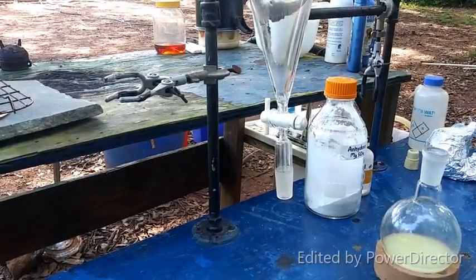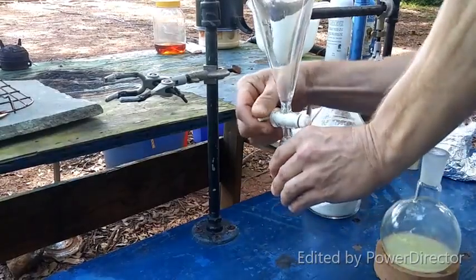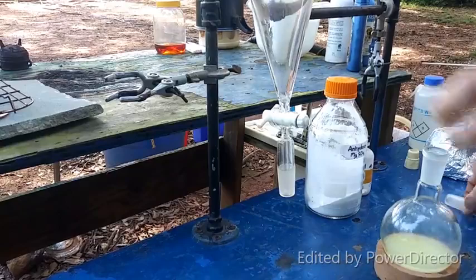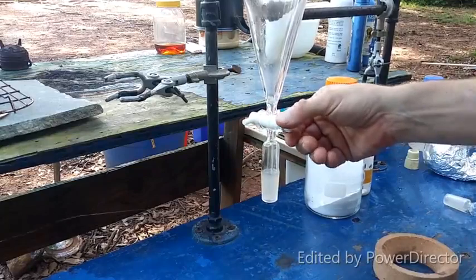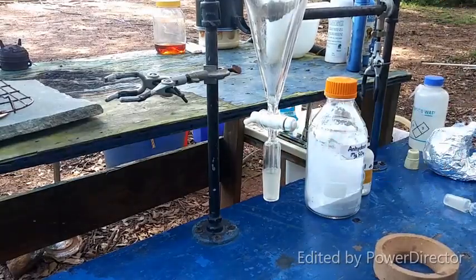Now we need to make sure that this is closed. Yep. Alright. And now I am going to transfer everything into the separatory funnel. Closed all the way. Okay, good. I don't want it dumping out of there when I pour it in here.